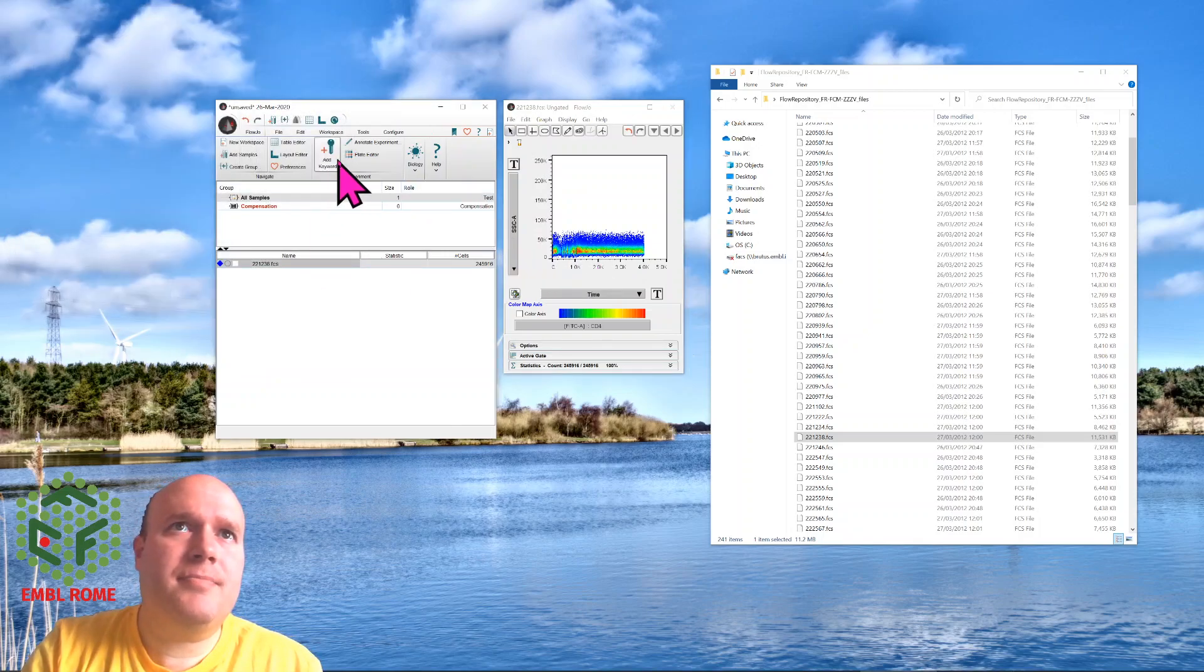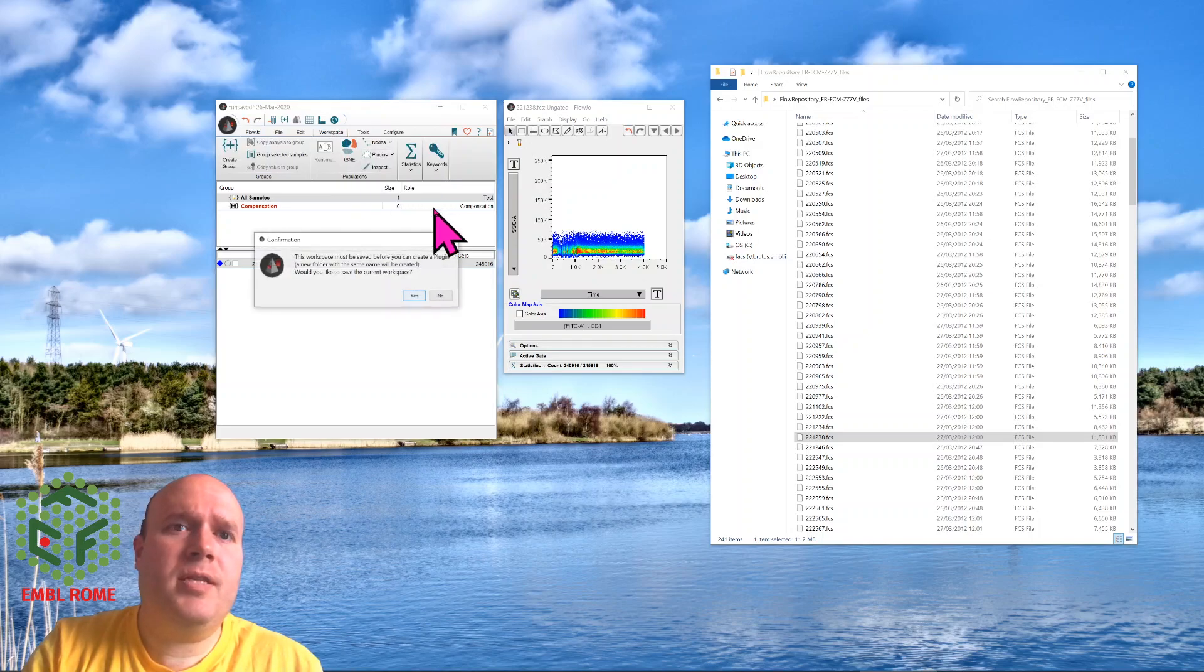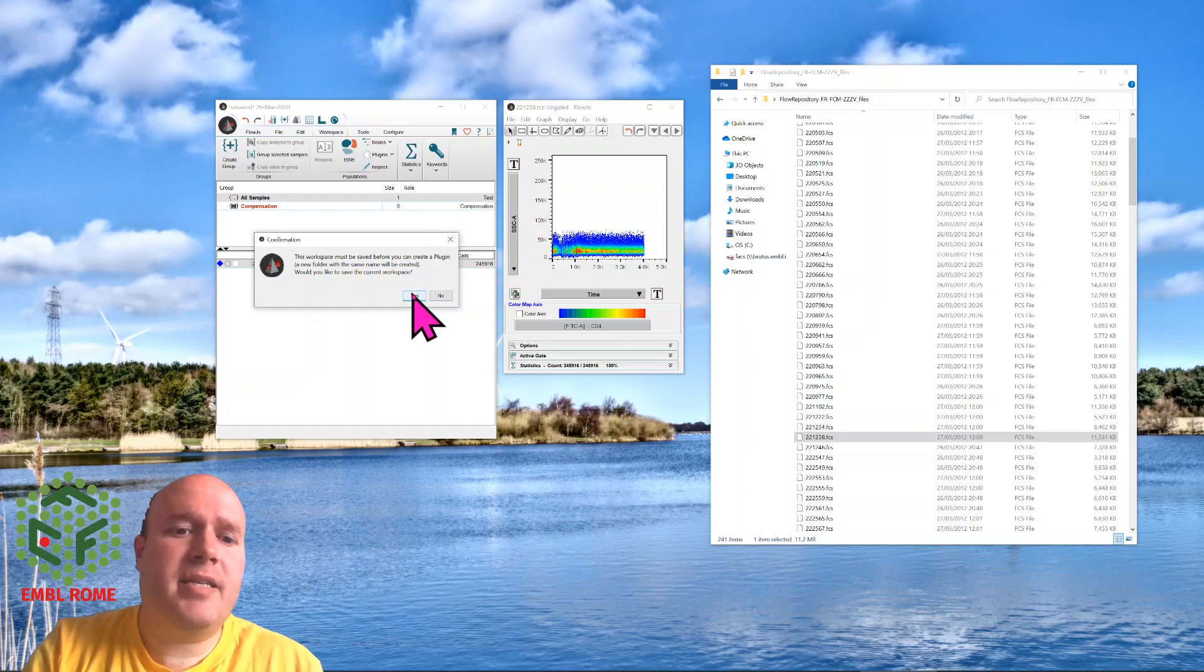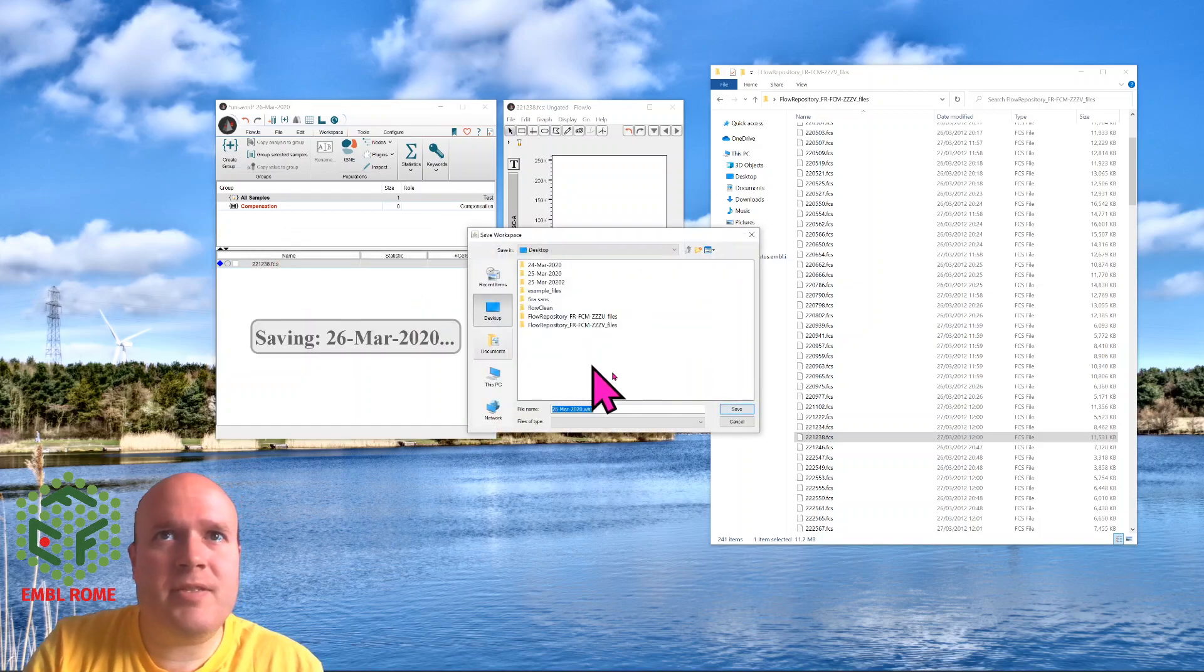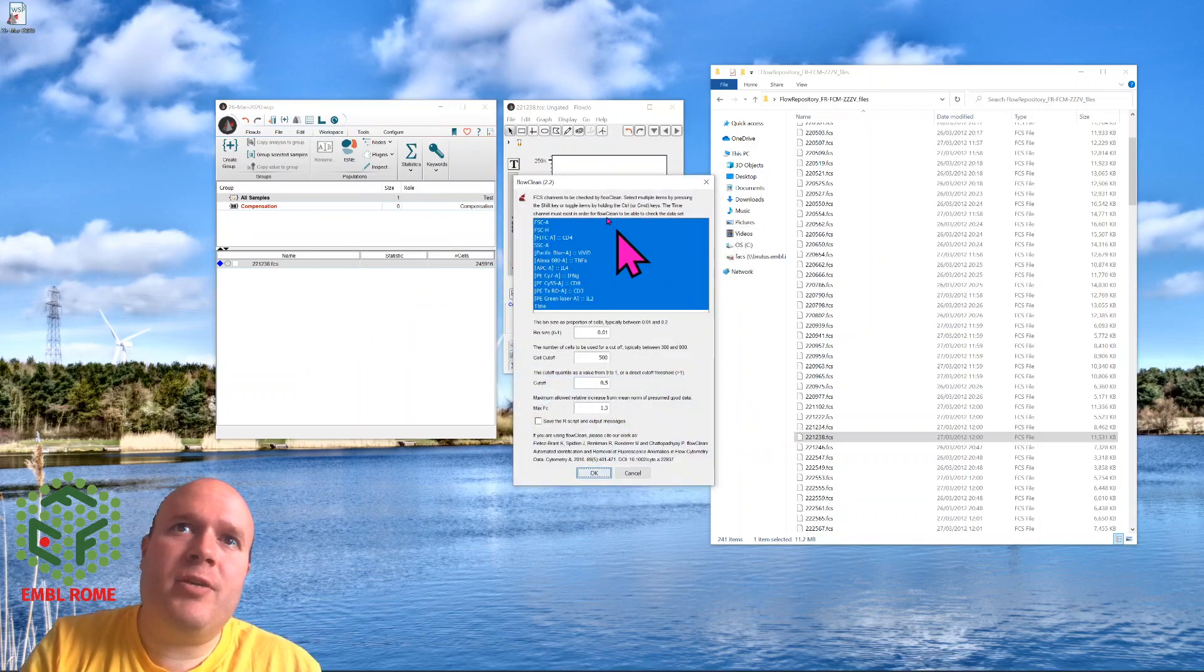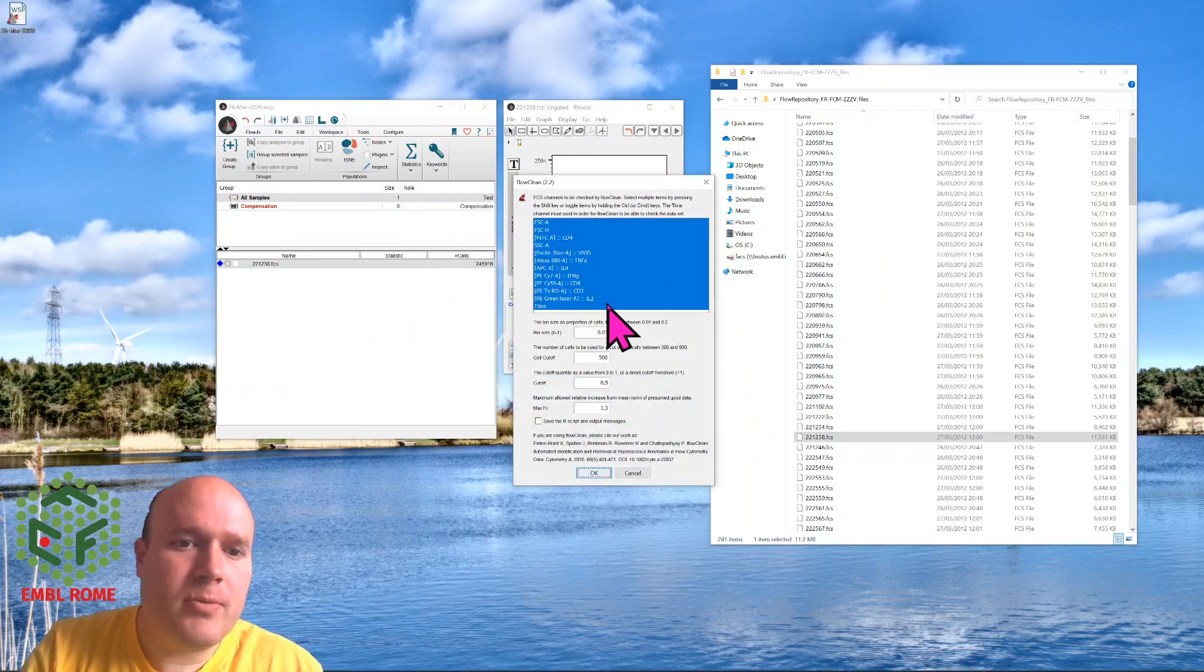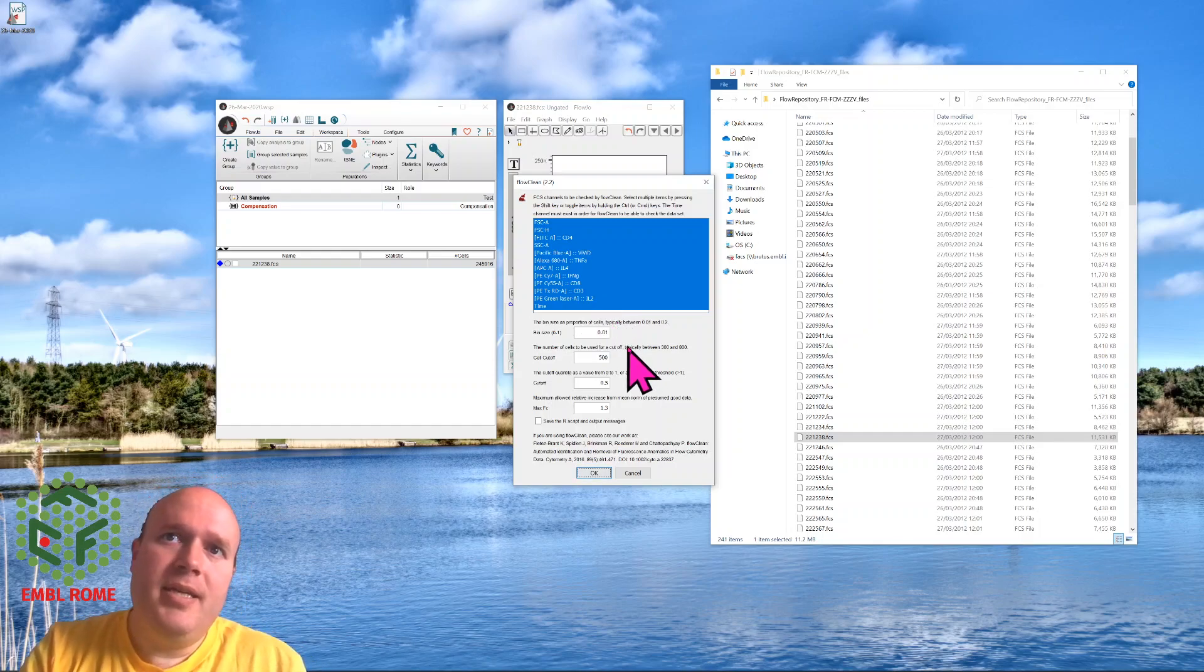So we highlight it, press workspace, plugins, FlowClean. It tells me the workspace needs to be saved first, so I'll save it to my desktop or wherever you want to save it. And it asks you for the parameters. You want to choose all the parameters, all the ones you're using, especially time.